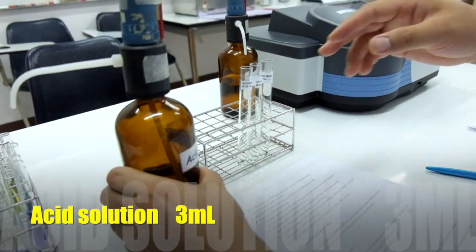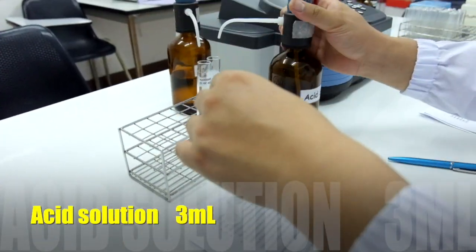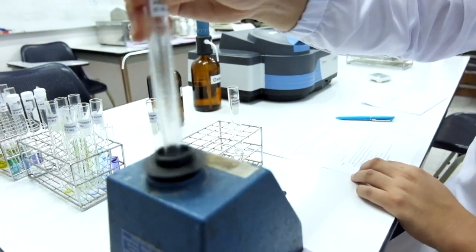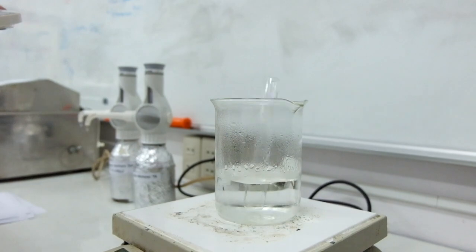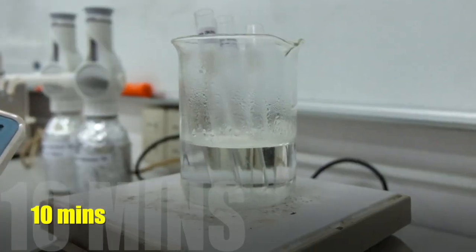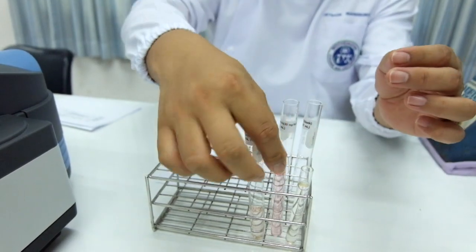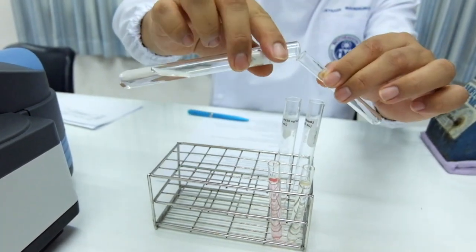Then add 3 milliliters of acid solution into all the tubes. Mix well with the vortex mixer and boil all the tubes for 10 minutes. After that, leave them cooling down and pour the solution into cuvettes.